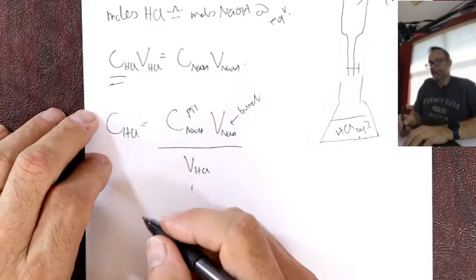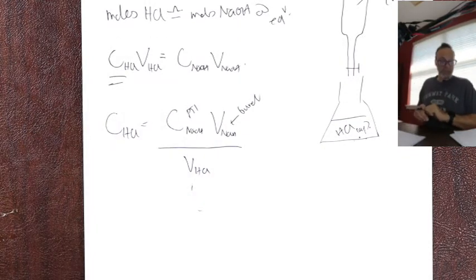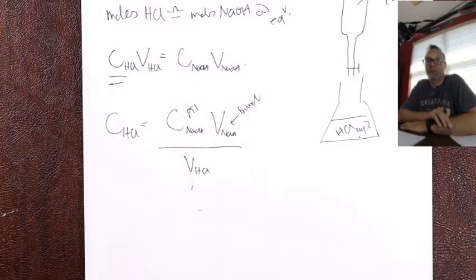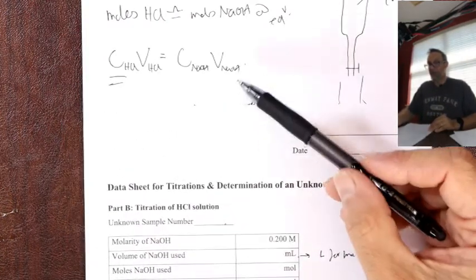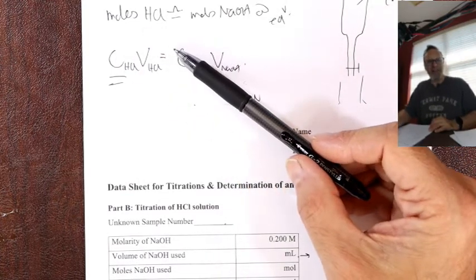And you work it out, and hopefully you're going to get, I can't remember the actual answers, but it's typically things in the 0.1 range, okay? So maybe your answer will be 0.1 through 0.3, with 3 significant figures, most likely moles per liter for the answer. Make sure that goes on the data sheet. So summarize your answers here, show the calculations just like I've done. I think it says on Pivot, don't do this. Huh? That's how you work it out.